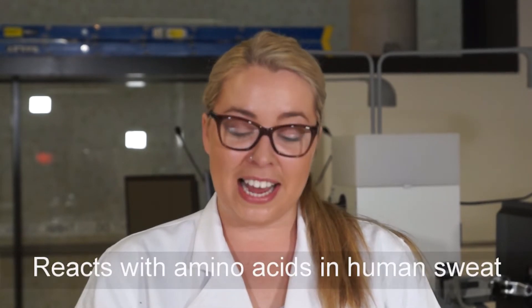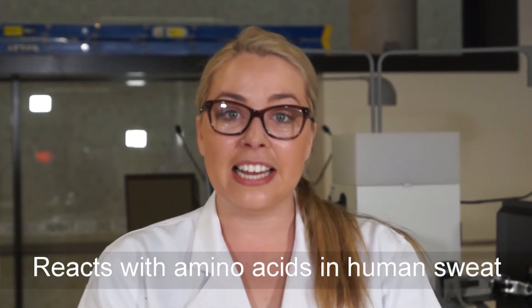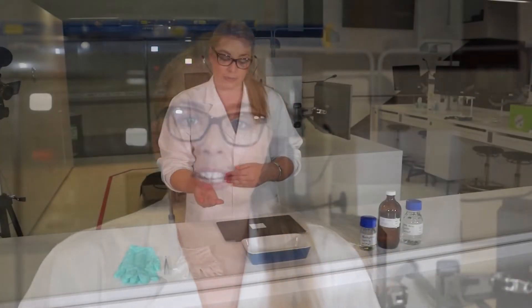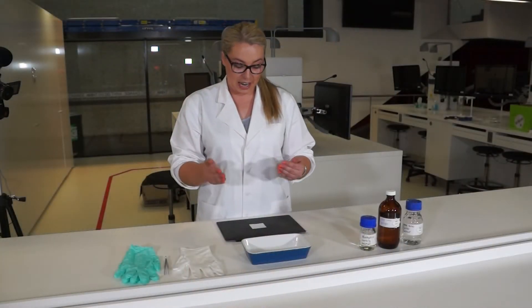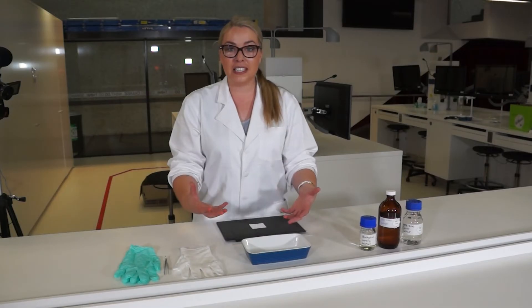The ninhydrin actually reacts with the amino acids that are secreted by our skin and are contained within our sweat. What I'm going to show you today is we're going to put some fingerprints down, we're going to develop them, and then we're going to see what comes up.